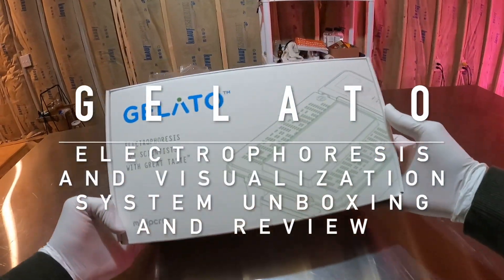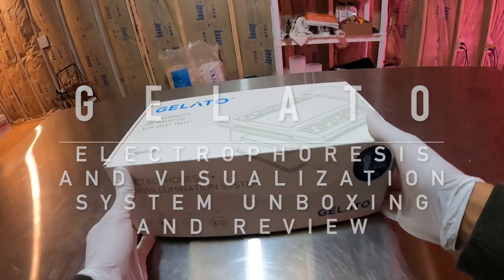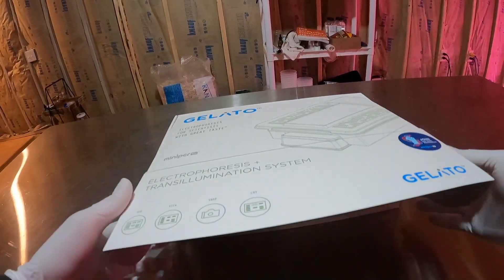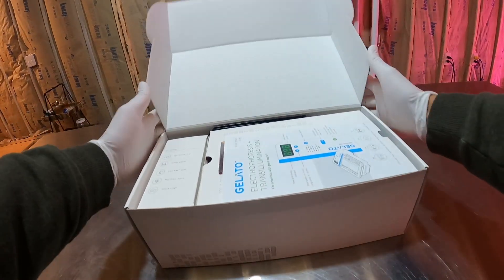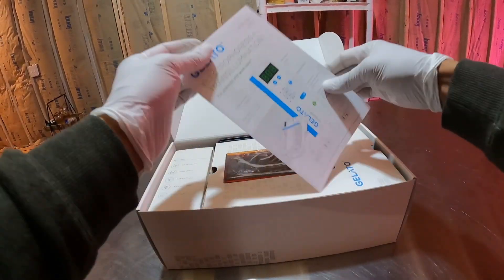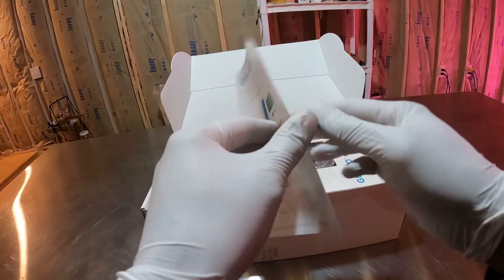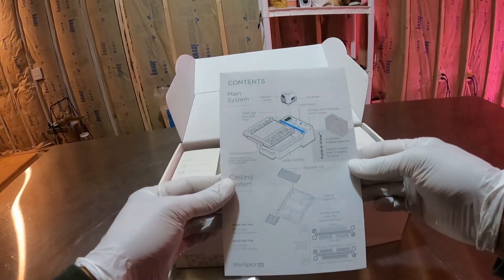What's up everybody, it's William Padilla-Brown coming at you. Today we're going to be unboxing and reviewing the Gelato Electrophoresis and Visualization System from MiniPCR. I've been using MiniPCR products for about two years now and I really love how user-friendly they are.